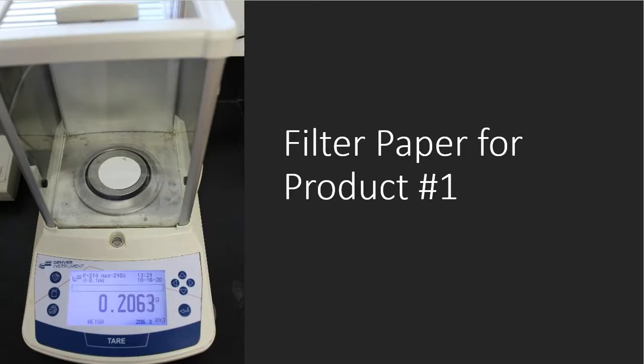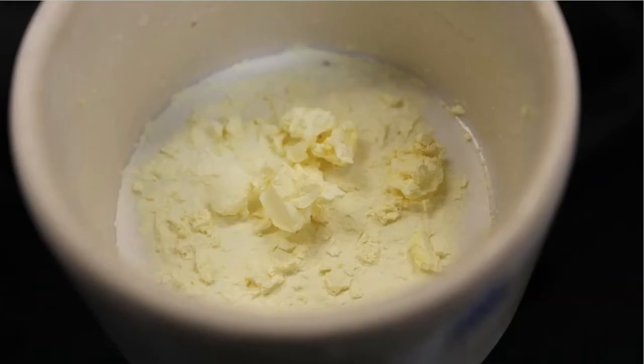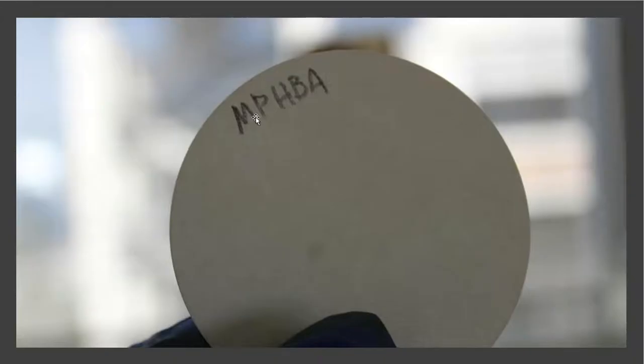is 0.2063. All right, so here is the solution of the acetanilide. I'm going to pour that through the Buchner funnel yet again, and this is what I end up with. Right there. That's the observation of my recrystallized product for acetanilide. Now I'm going to have to do the same thing for my methyl para-hydroxybenzoic acid.